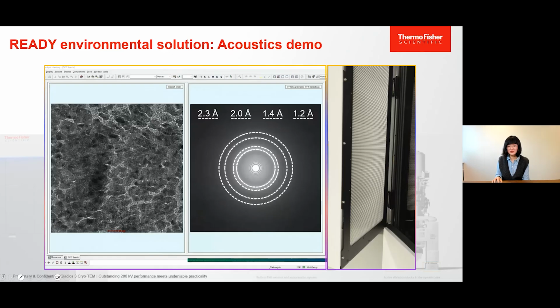That's very high resolution. And then right is what happens in the room. We will talk, laugh, clap, and I want you to focus on the 4 gold rings to see what is the acoustic noise to these rings.